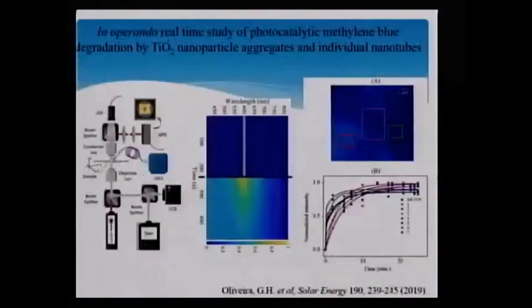This is another toy of René. This is like a UV microscope. So, well, I will not stop here. Here we shine a titanium oxide nanoparticle surface with methylene blue. It is very well known that you can degrade methylene blue at the surface of titanium oxide nanoparticles. So it was a proof of concept experiment.